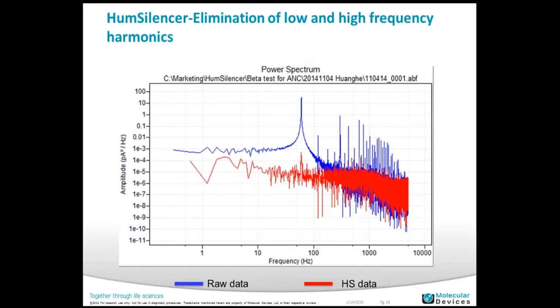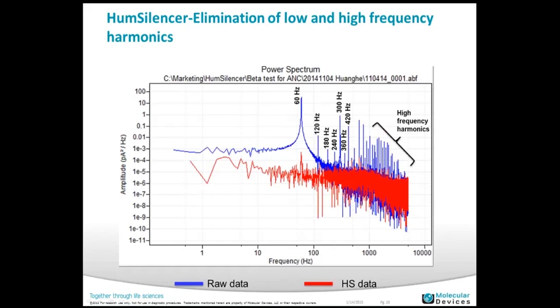I also mentioned that the Hum Silencer eliminates not only the 60 Hz or 50 Hz fundamental frequencies but also the high-frequency harmonics. Looking at the power spectrum of the signal, the blue line is the raw data and the red trace is the Hum Silencer data. You can see spikes at 60 Hz, 120 Hz, 180 Hz, 240 Hz, up to 420 Hz — all those spikes were eliminated. You don't see those spikes in the Hum Silencer traces, confirming that the high-frequency harmonics are clearly eliminated.